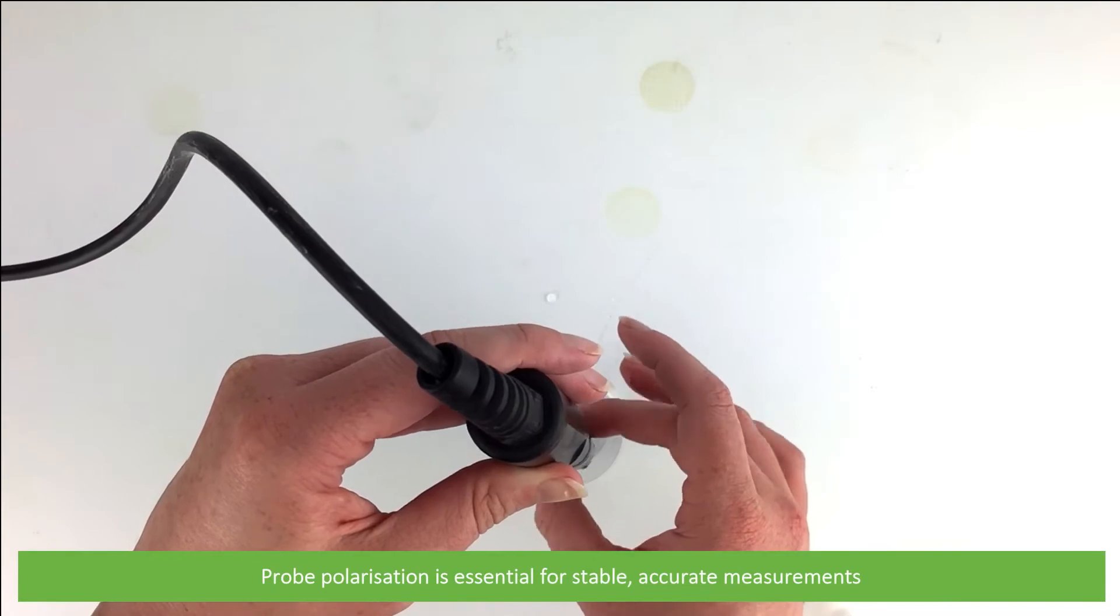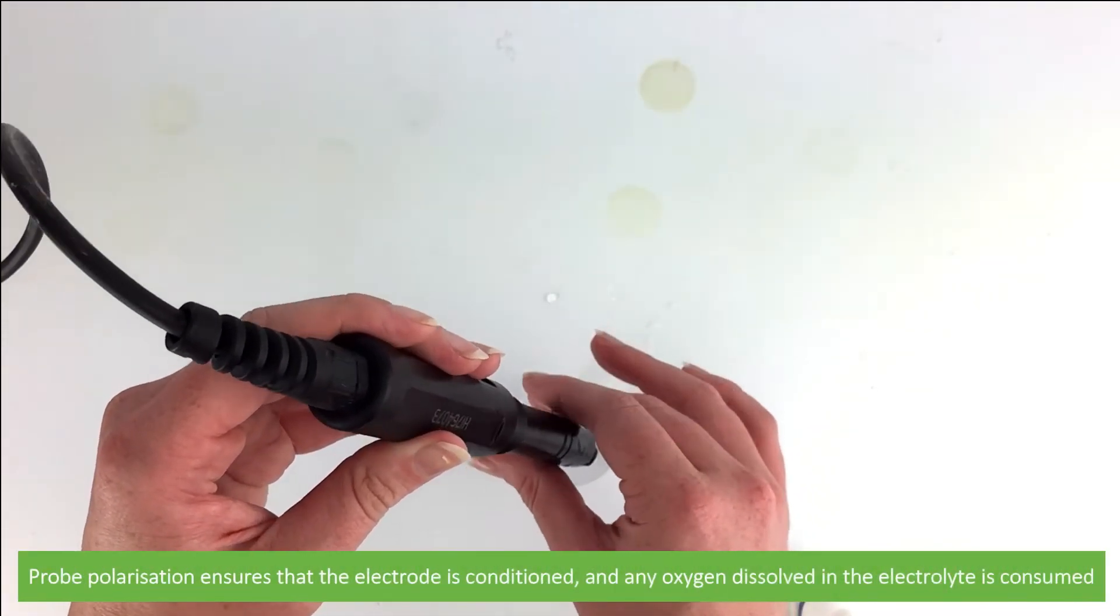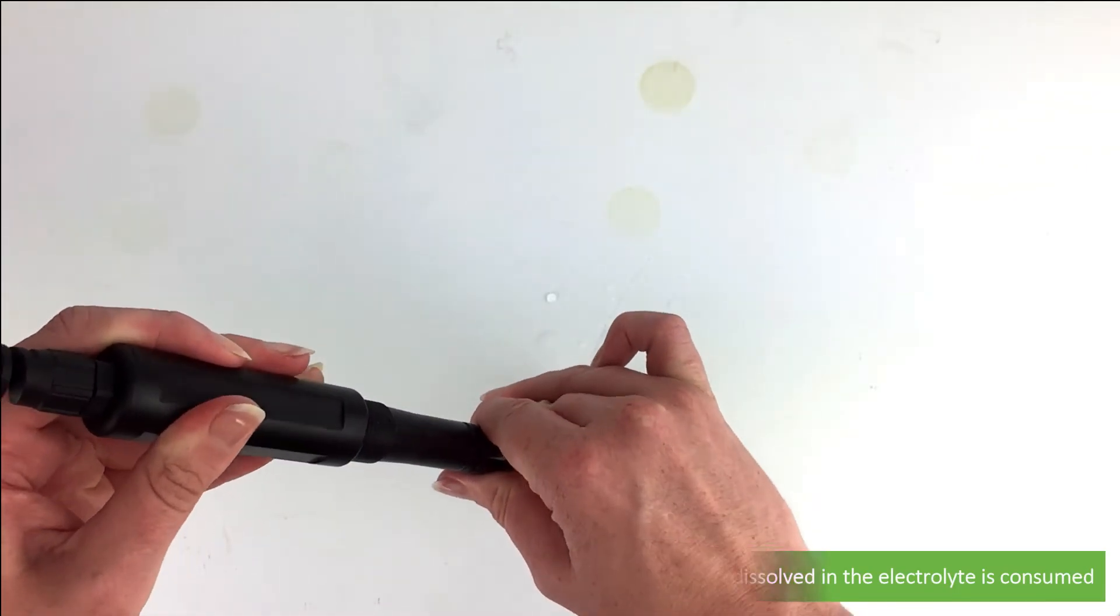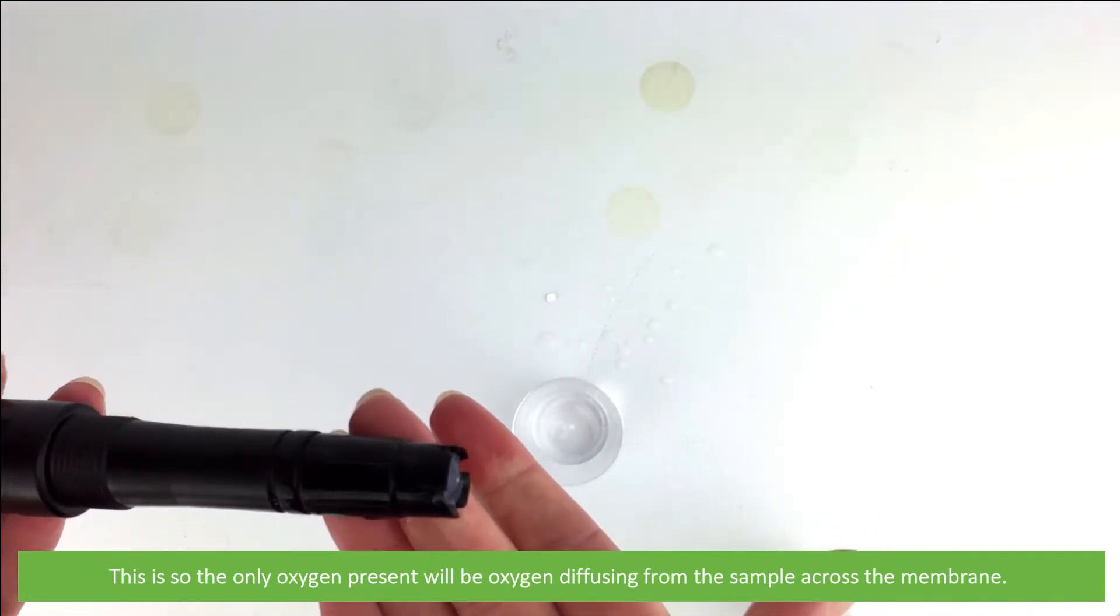Probe polarization is essential for stable, accurate measurements. Probe polarization ensures that the electrodes are conditioned and any oxygen dissolved in the electrolyte is consumed. This is so the only oxygen present will be the oxygen diffusing from the sample across the membrane.